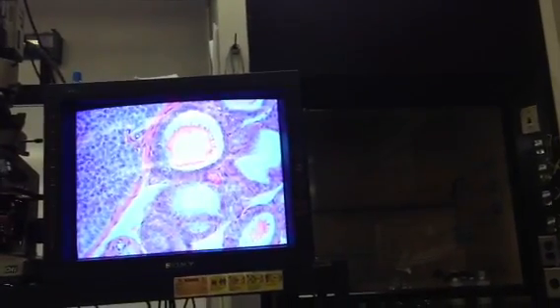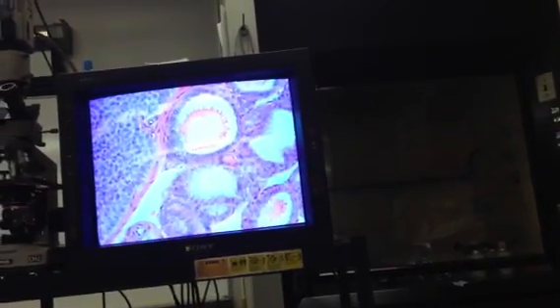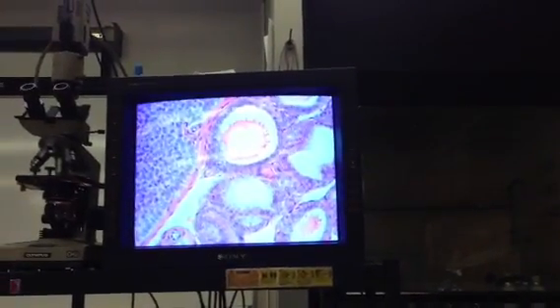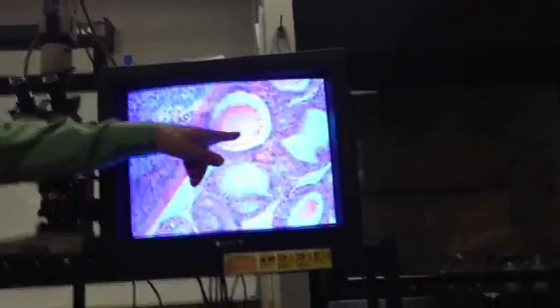What you're saying is that the red blood cells are observable in blood. Yeah, observable. Blood is mostly red blood cells. So if you see a blood vessel, that's what it'll have in it. But this is what thyroid follicles look like.